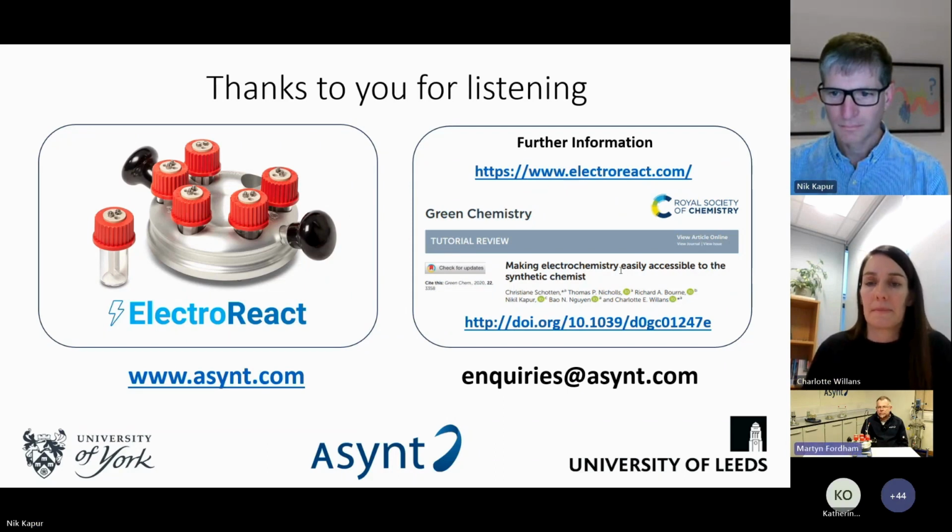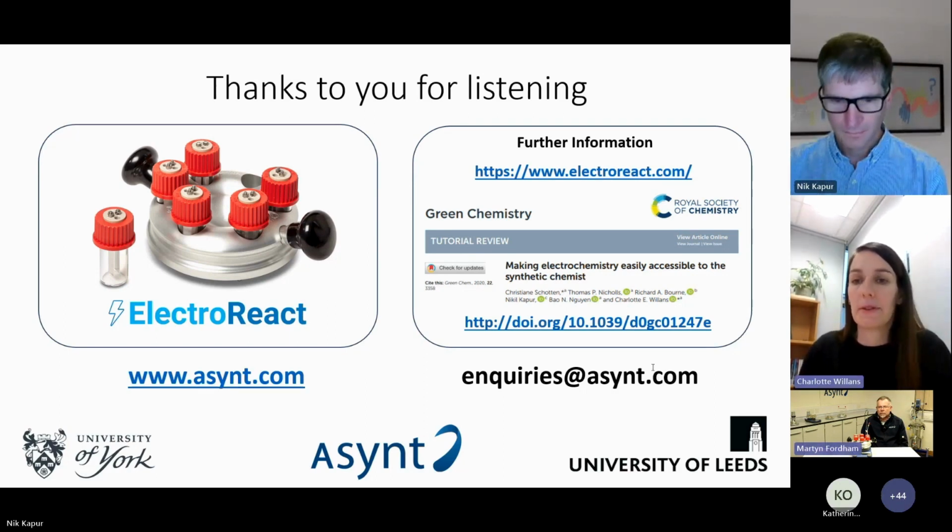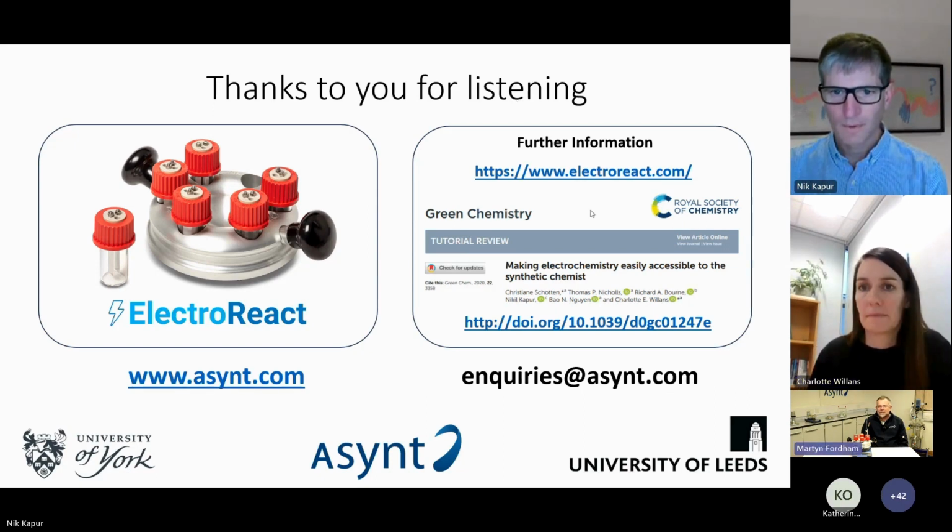Thank you, Charlotte. I think we've got a question coming on the chat regarding cyclic voltammetry. The software has to come from the potentiostat being used. Is that correct? Yes. So different potentiostats will come with different software. So yes, I think that might be it then for questions.